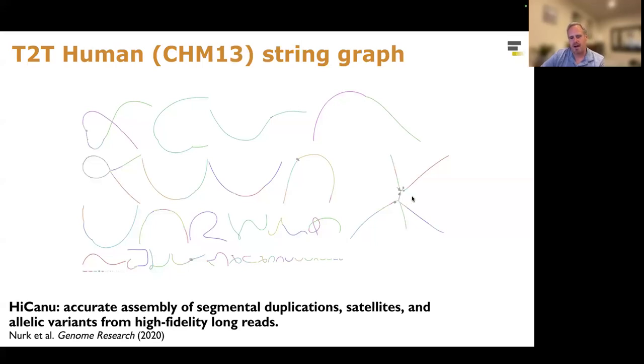Although there has been a lot of work, thanks to, for example, Verkko assemblers that can integrate HiFi data with ultra-long nanopore reads, you can often get complete telomere-to-telomere chromosomes using that Verkko assembler.